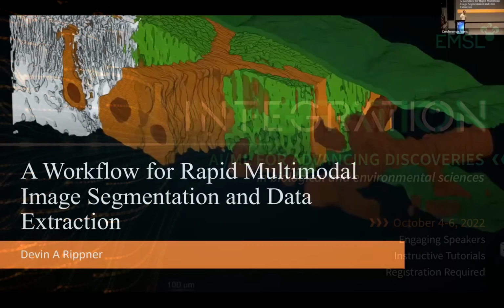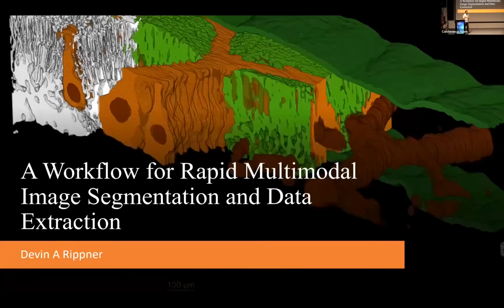So today I'm going to talk about a workflow that my collaborators and I developed for rapid multimodal image segmentation and data extraction. Initially this was primarily used for X-ray CT images, but it turns out that the workflow can be applied to any image.